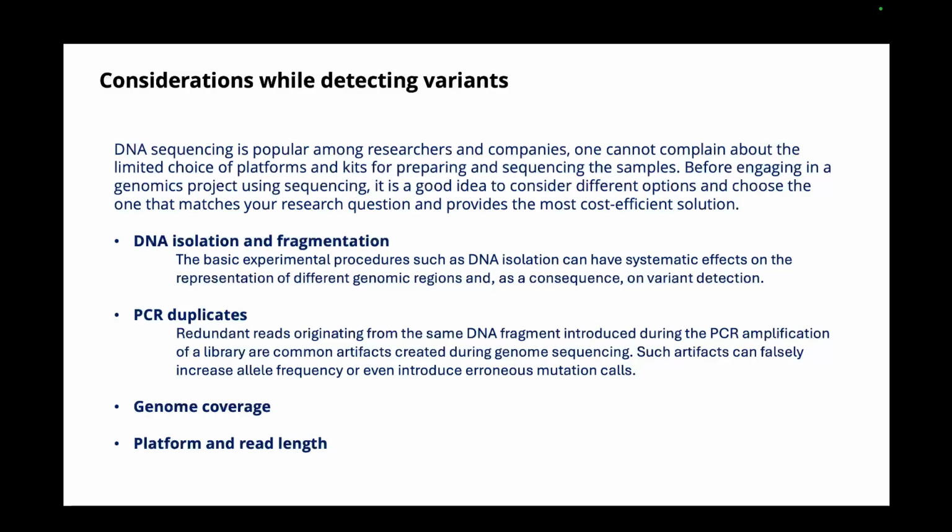Now, this is okay if you have single nucleotide changes. It's okay to detect single nucleotide changes with 300 or more base pairs of read length. But say, for example, you are detecting a structural variant, you are trying to detect a repeat region or some sort of tandem repeat, as I was speaking about. Tandem repeats can go on for thousands of base pairs.